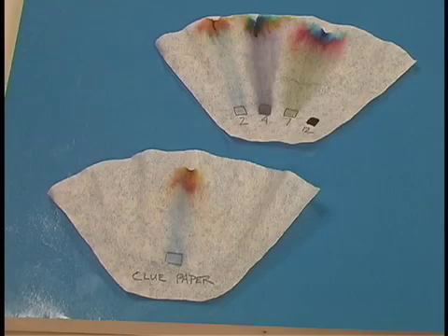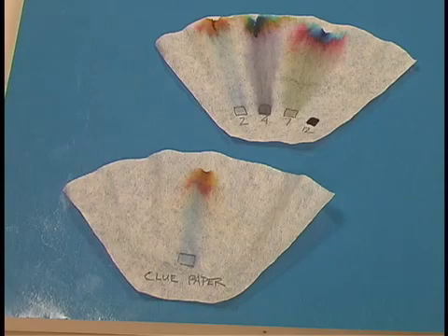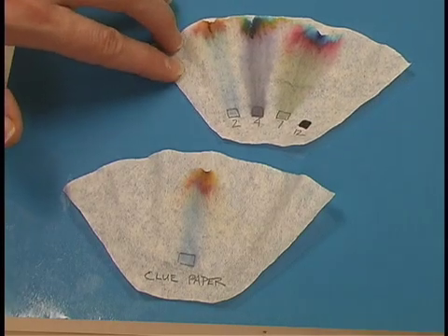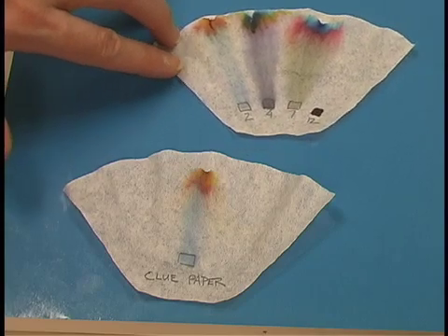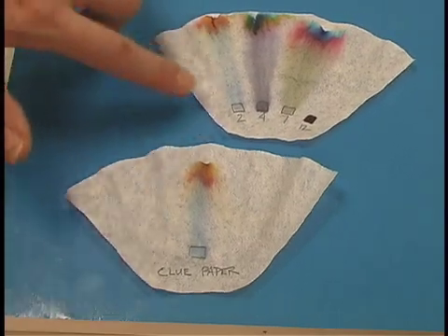Part of your advanced preparation on page G3 in the book, one of the things you can do is have a clue paper. If you're setting up your experiment as a mystery, you can pass out pre-made clue papers like this to your students. Then when they run their chromatography, they will develop patterns, and in this case you can see that the clue paper matches our marker number 2.